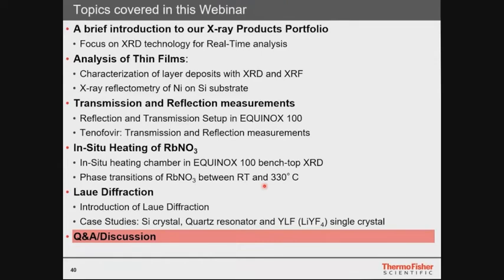Simon, the next question is in two parts. The question is, are there any advantages of XRD instruments for asbestos analysis? How can we analyze asbestos in cosmetic samples using XRD?